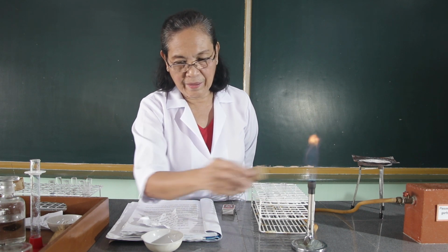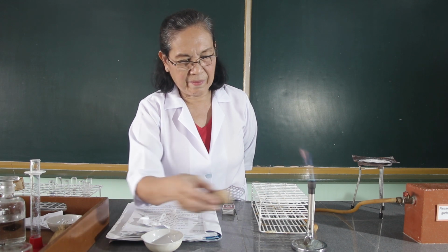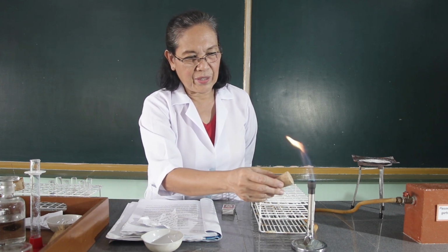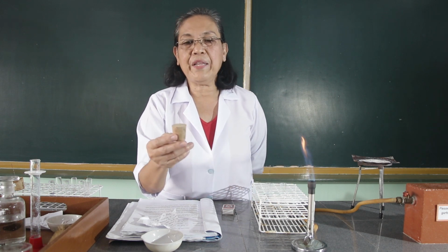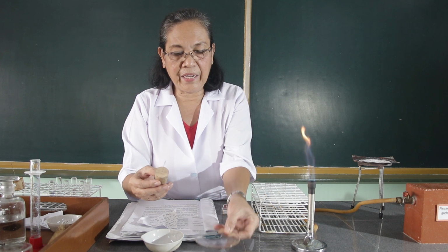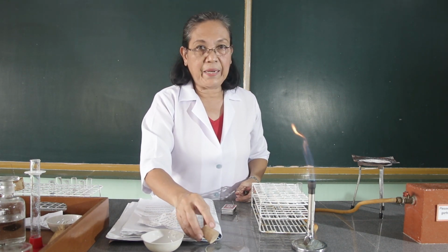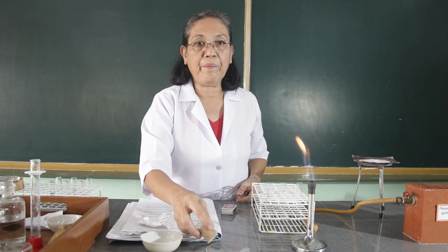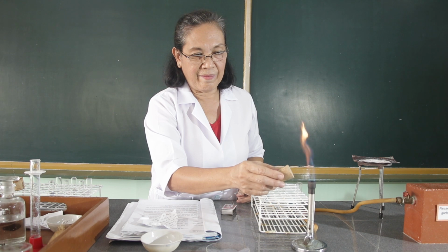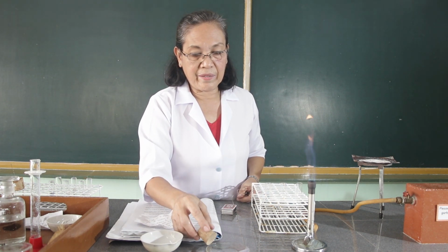Okay. Okay, I think no more. So, we will dip this nichrome wire into the ammonium carbonate solution. Please try to observe the color imparted by the flame. Red.